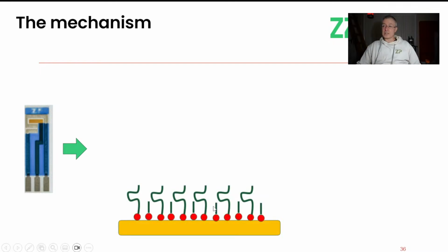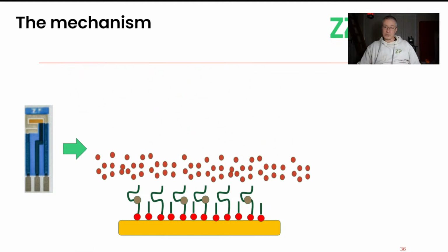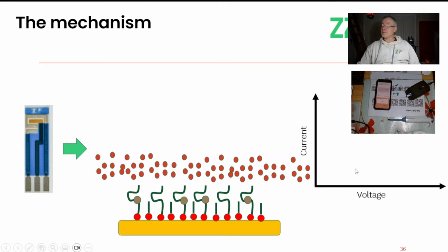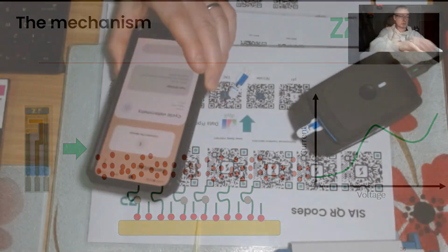So you take a gold electrode, you put your aptamer or your antibody on there. In this case, they had an anti-ferritin, they had ferritin, so it blocks the sensor. And then they have a ferrocyanide, which wants to access the electrode, but because of the blocking by the ferritin, it slightly blocks the surface, and then they get a signal, and you can read that signal. They were probably reading it by differential pulse voltammetry.